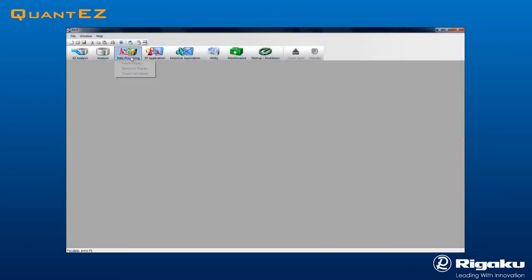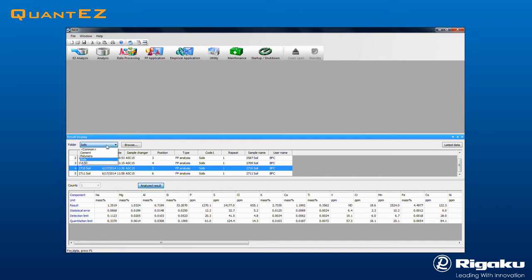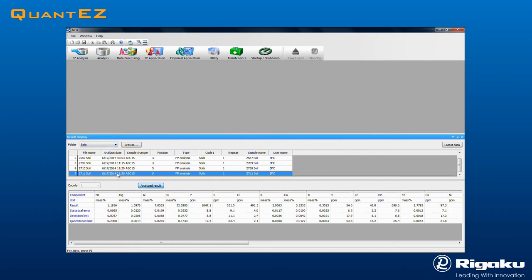To view the results of any measurement in spreadsheet format, click the Data Processing icon and select Result Display from the drop-down menu. Find the desired data folder and select a result to view. From this view, data may be exported to a spreadsheet.